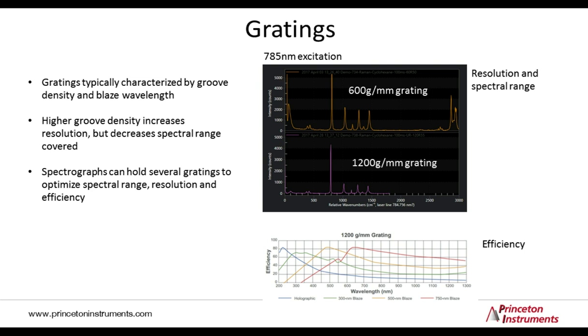I would like to note that larger spectral ranges can be obtained by using step and glue techniques, where the grating is moved to different wavelengths between acquisitions. While this takes a little bit longer time, it will also reduce the wavelength accuracy somewhat due to the inaccuracies of the mechanical grating drives. So it's important to use a high-quality spectrograph that can keep these errors minimal if a step and glue acquisition is required.